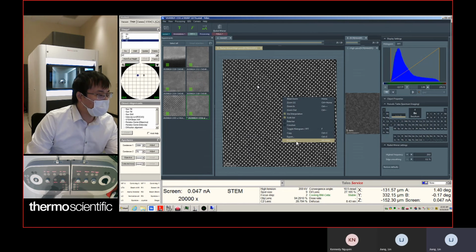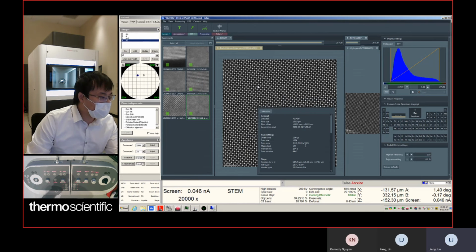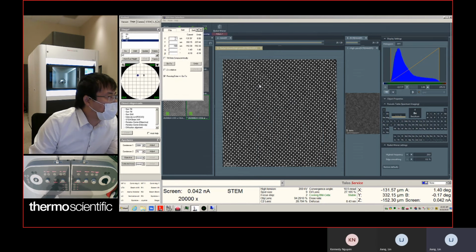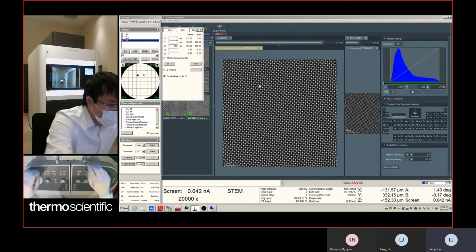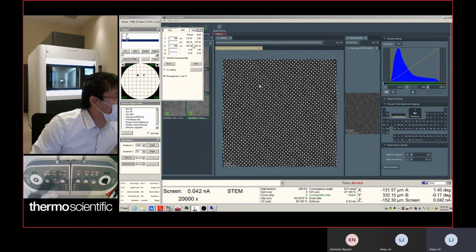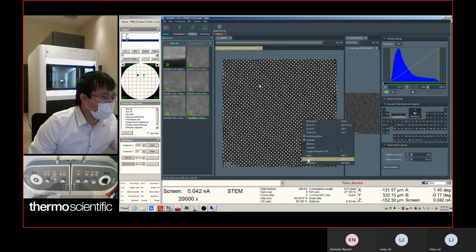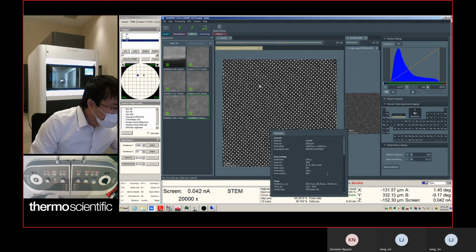Let's just do a quick example here. It's 187, 326. How about Z? Z is negative 147.